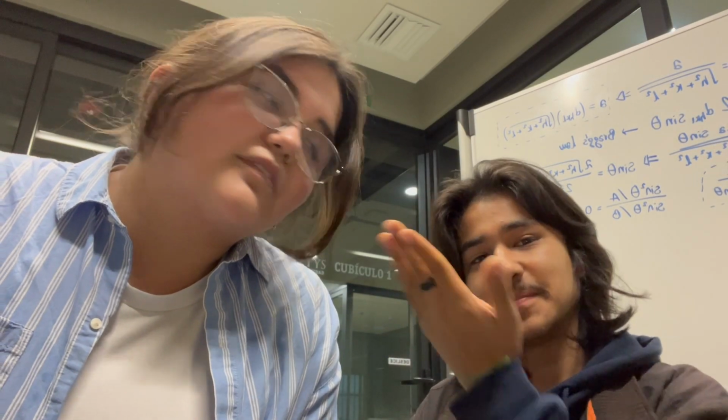Hello, our names are Laura and Sebastian, and today we're going to explain the powder method for X-ray diffraction for the unit cell of potassium.